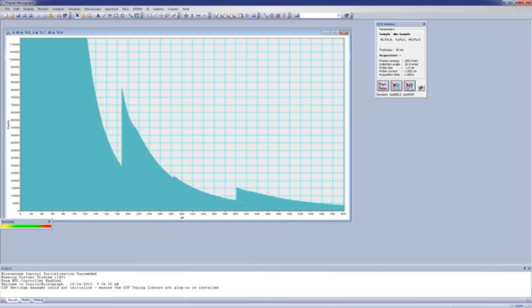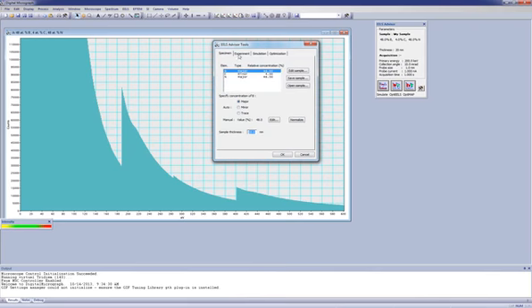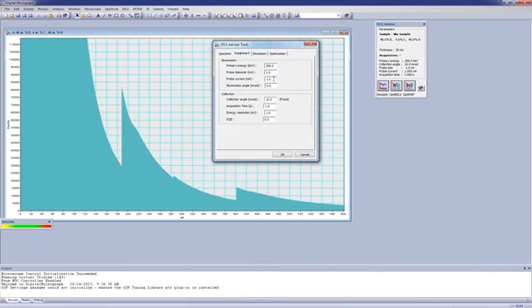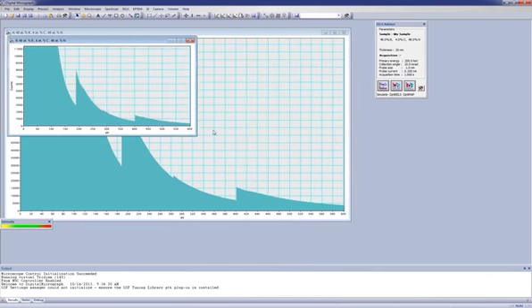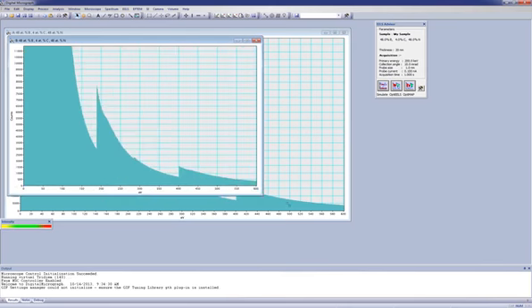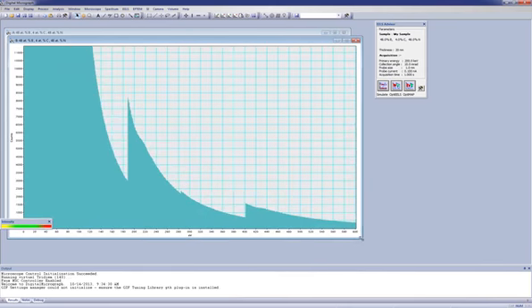And we can essentially play around with that a little bit by going into the tab, adjusting the acquisition time, for example, and coming up with a spectrum that maybe shows a little bit more noise, and shows the effect of basically changing the acquisition conditions on the form of the resulting spectrum.